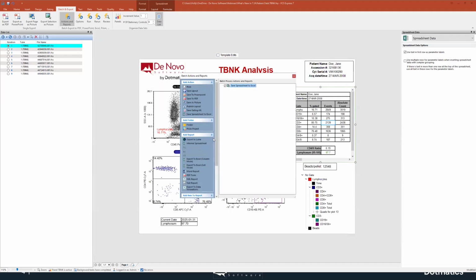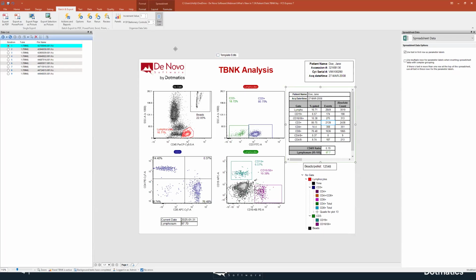Okay. And then my final big ticket, I think it's a big ticket item. It's my favorite thing that we've added to the software: the token report. So a lot of times in clinical and validated laboratories, once we create a layout, we need to check and validate that we've done these calculations correctly. Did we calculate our CD4, CD8 ratio appropriately? Is that custom token that we built, was it built correctly? Things like that. And we would have to document that it was checked and verified, and then provide it for a CAP inspection or wherever you're being audited.